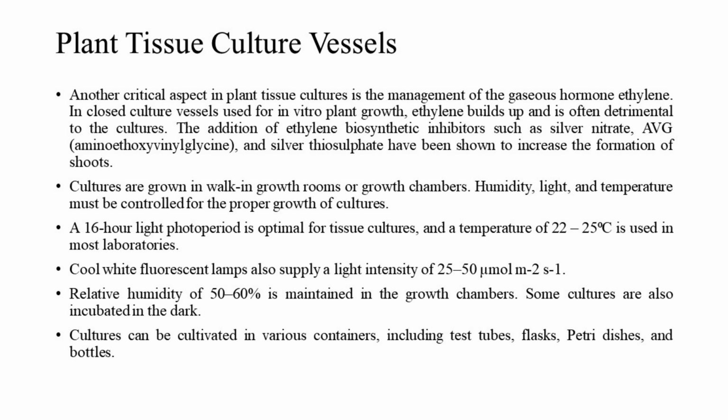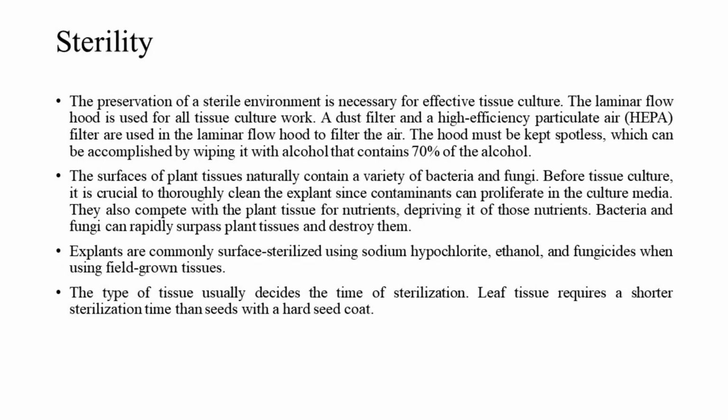Cultures can be cultivated in various containers, including test tubes, flasks, petri dishes, and bottles. Sterility. The preservation of a sterile environment is necessary for effective tissue culture. The laminar flow hood is used for all tissue culture work. A dust filter and a high-efficiency particulate air (HEPA) filter are used in the laminar flow hood to filter the air. The hood must be kept spotless, which can be accomplished by wiping it with alcohol that contains 70% of the alcohol.